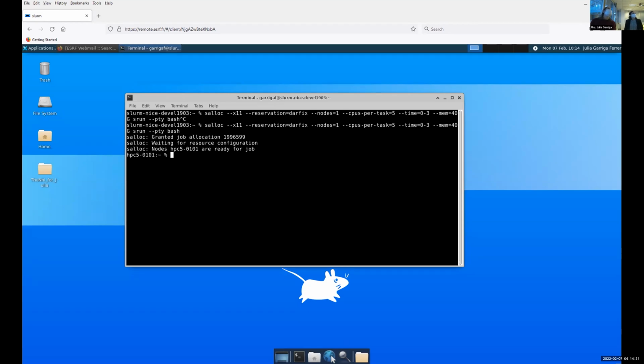Okay. And you all see the shared screen? Yeah, because in principle, you should be able to see the terminal, but I don't know if it has been done. I can see the shared screen, so I confirm that they should be able to. Good.